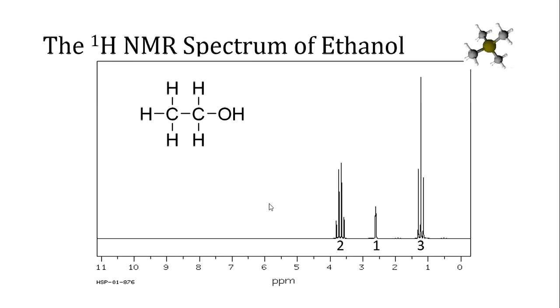The chemical shift represents the difference in that required for the proton in the molecule versus that of the internal standard. It's ordered from high numbers on the left to low numbers on the right, because what we're actually measuring is how much less energy is required to spin flip these protons than those of tetramethylsilane.